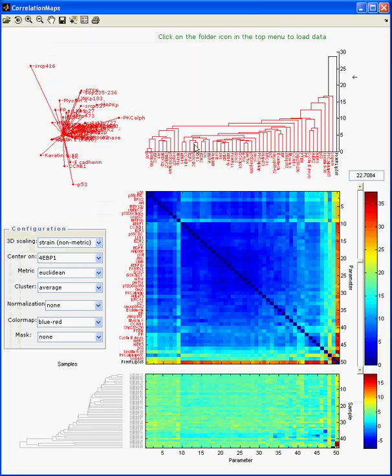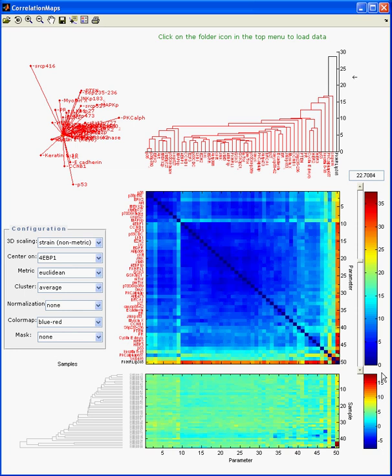When you load the data, immediately a number of different settings are used to produce the following display. Starting with the lower left-hand side, you have here the cluster analysis of the samples themselves, according to some sort of metric — we'll go back to that in a minute. And then what we have here is the actual data, the values between some negative value and 20. And this is the first point where you may want to think about normalization.